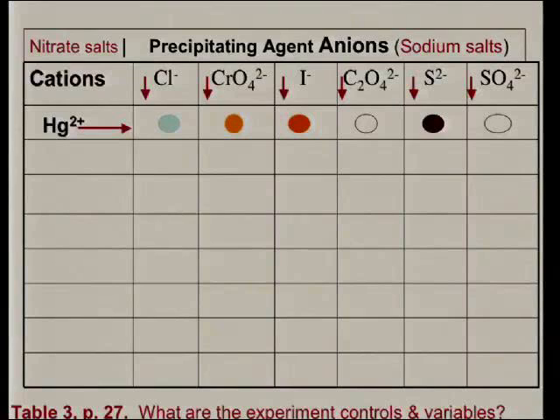You record how many times it precipitates, and if the precipitate is white or a color other than white, please note that. Any precipitate that is white is colorless in solution. Just like table salt that's white becomes colorless in solution, anything that has a color other than white as a solid itself will have a color.